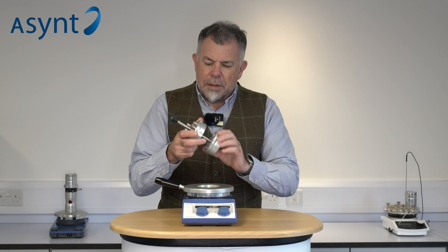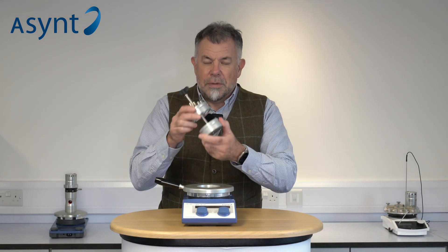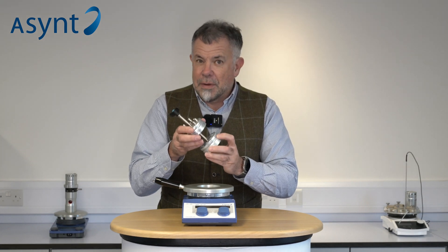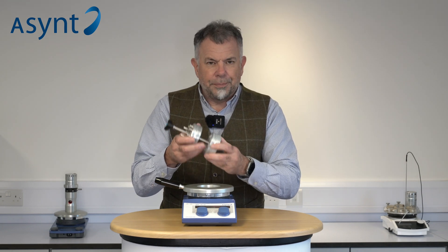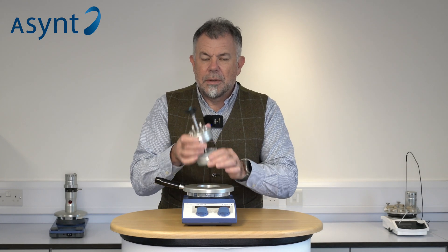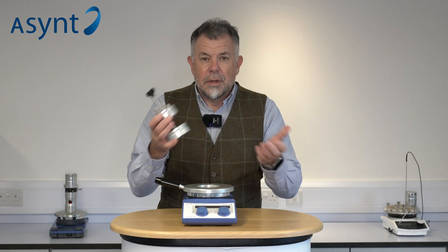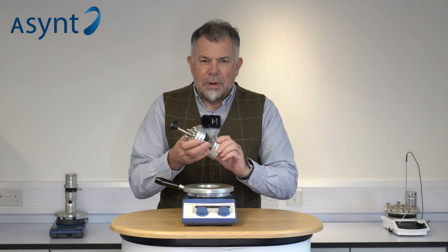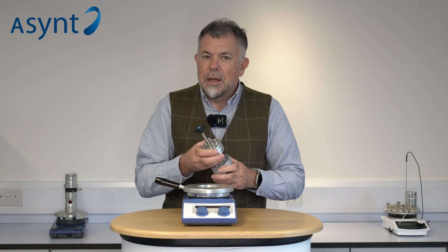And then this gave our customers some ideas. How could we do photochemistry in parallel? How could we screen photochemical experiments in an Octo? Could that be possible? And I thought that makes sense. The customers in question really love using the Octo as it is for screening regular chemistry. So let's get to work and see what they think. And we made the Illuminate.